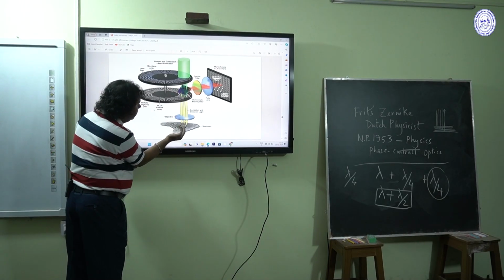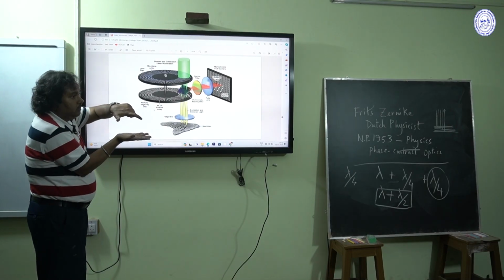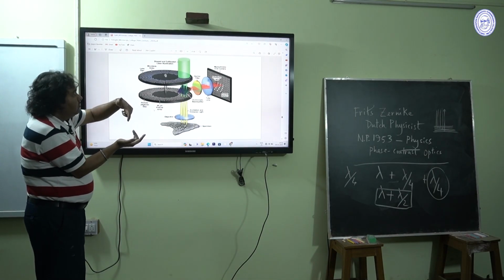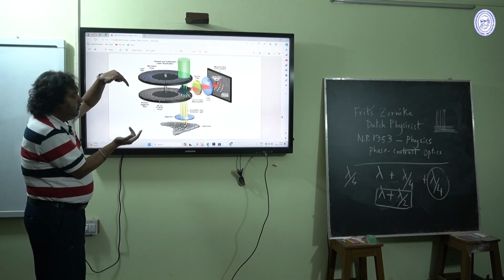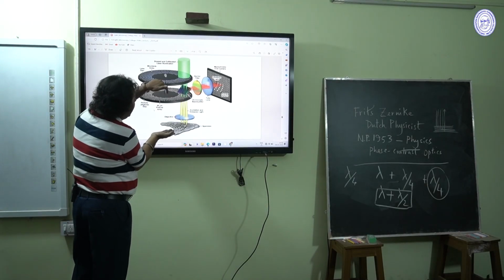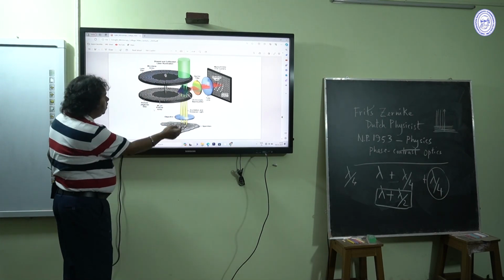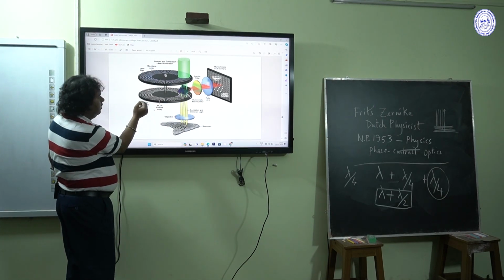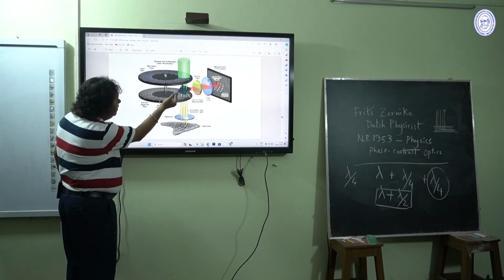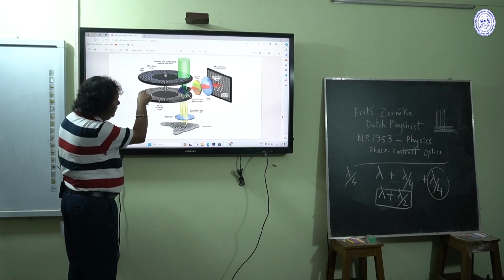Light may be coming from different depths of the specimen, so their conjugate focal planes will be at different places. Only the light that has the conjugate focal plane onto the pinhole, that is the Nipkow disc, will be able to pass, and it is spinning.